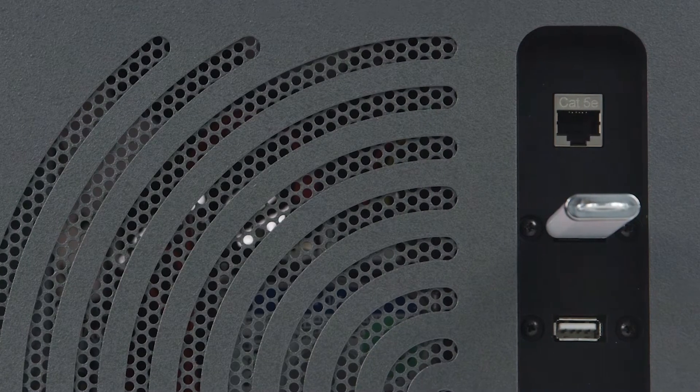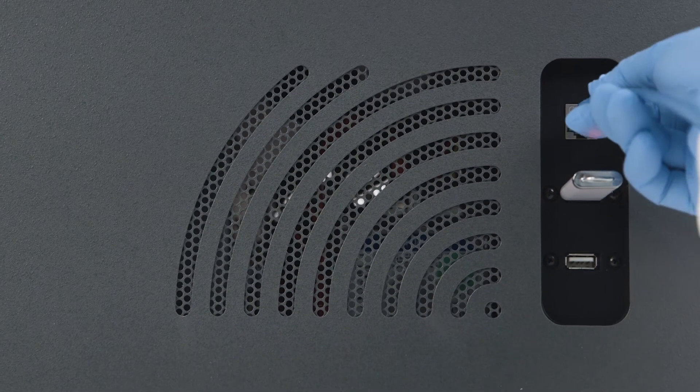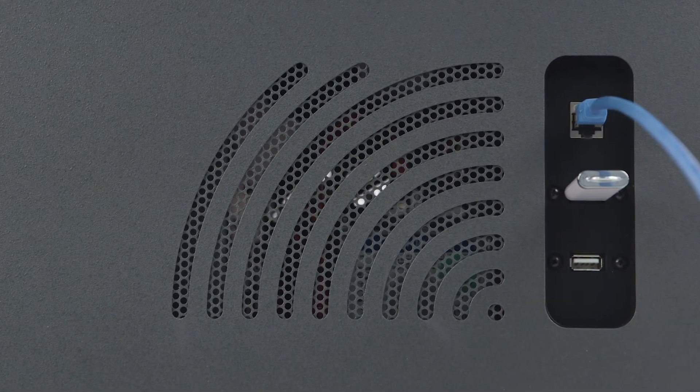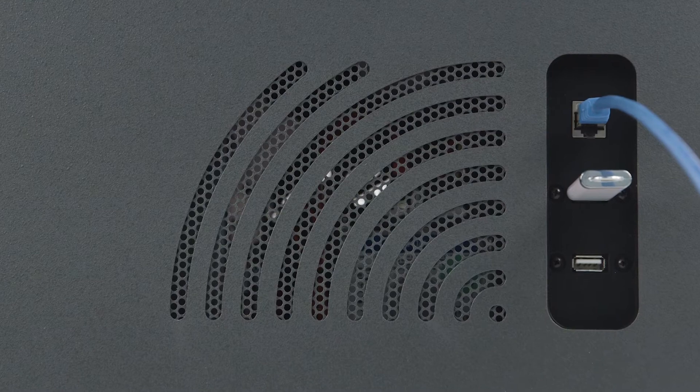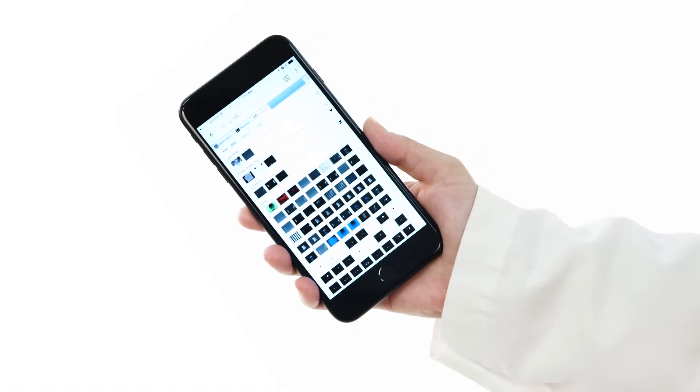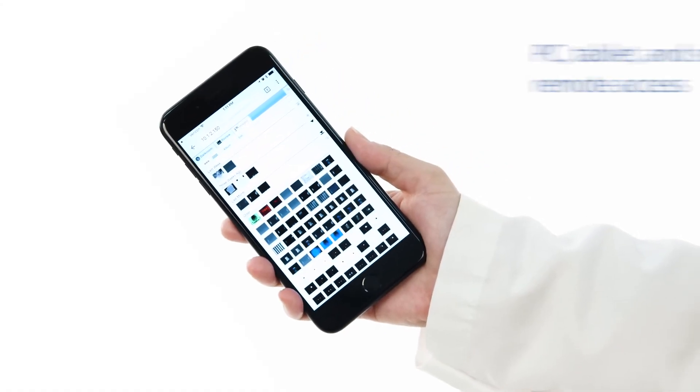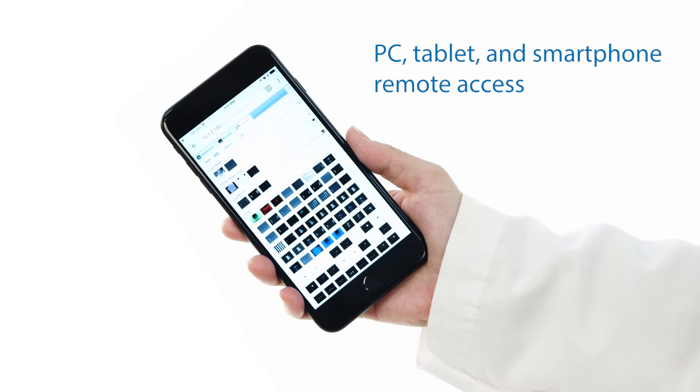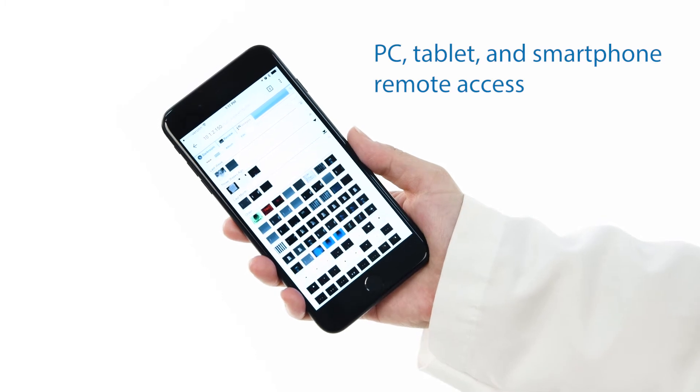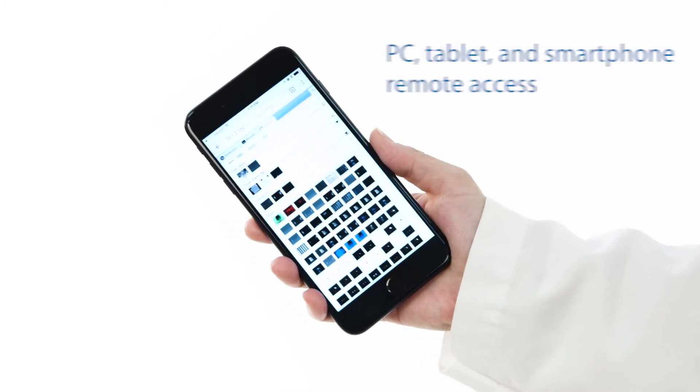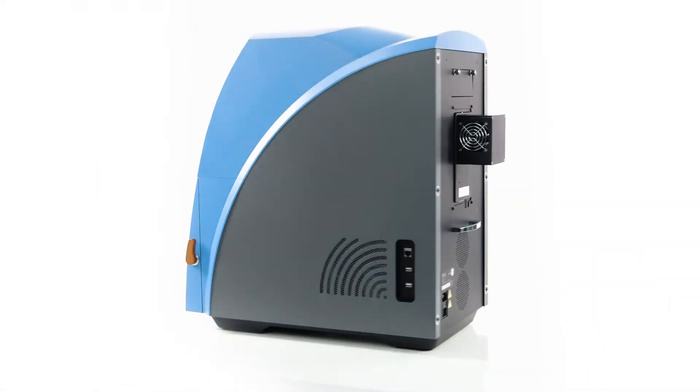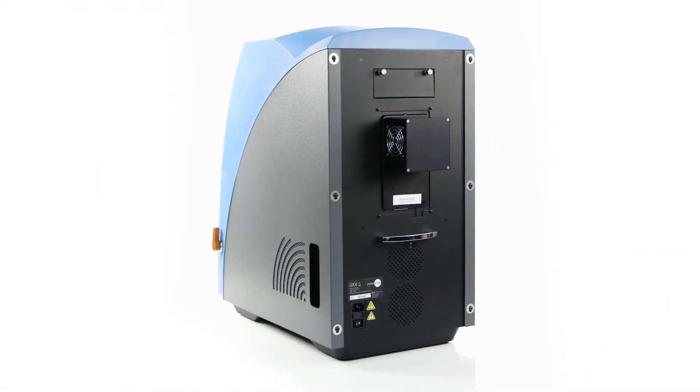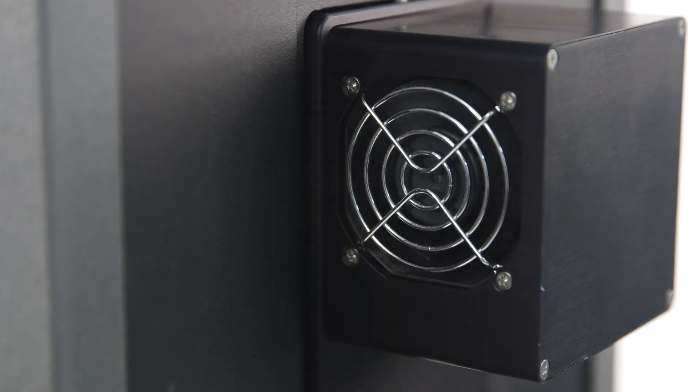There is also an Ethernet port, which allows the imager to be placed on a local network, allowing it to be remotely accessed and controlled from a web browser on a PC, tablet, or smartphone connected to the same network.